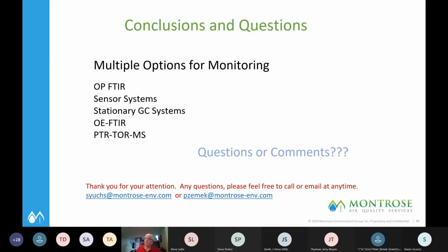Or another way you can do it is you can take a full vial sample with no headspace, seal it, and send it to our sister lab, Enthalpy, and they will do a stripping and collecting purge and trap GC test on it, where they will take that water, put it in a system, bubble it, collect everything on an absorption trap, and then desorb it and flash it to an instrument to determine the quantity.